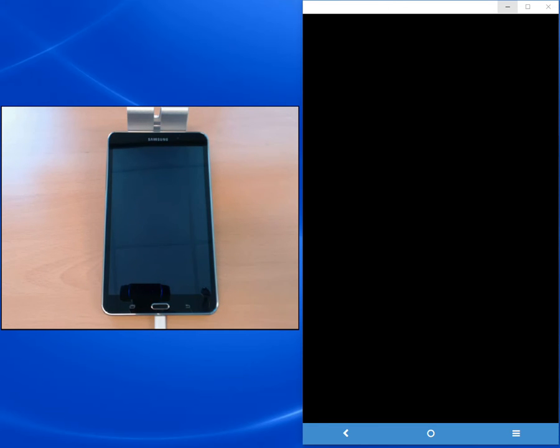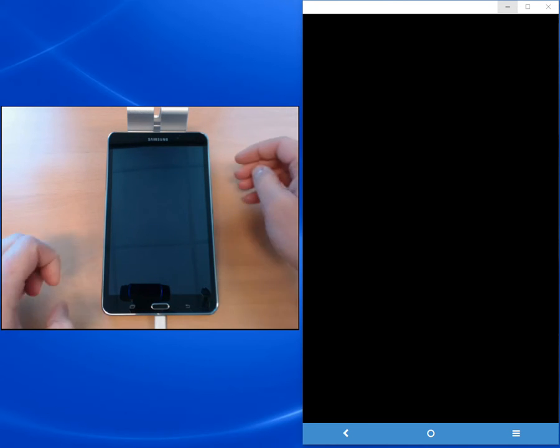I'm using for this tutorial the Galaxy Tab 4 with a 7 inch display.